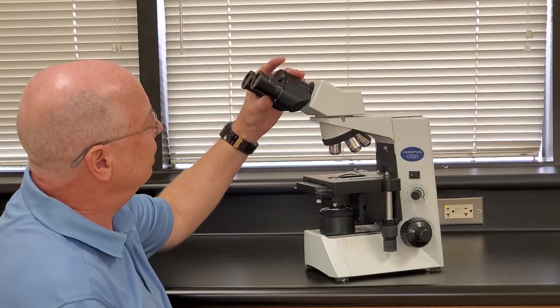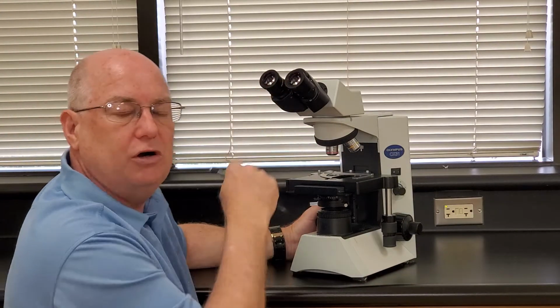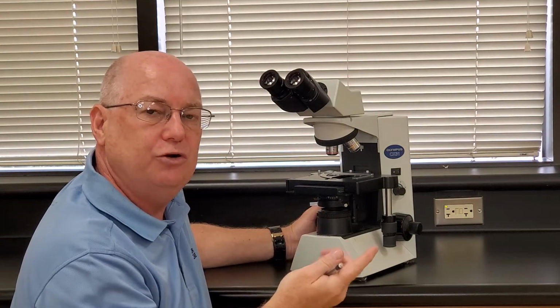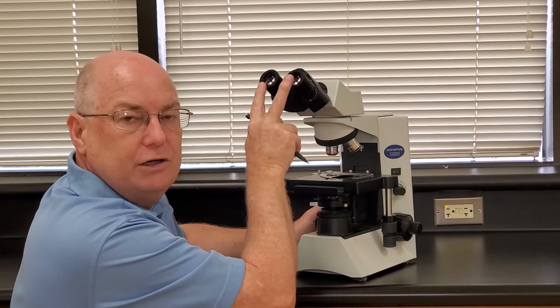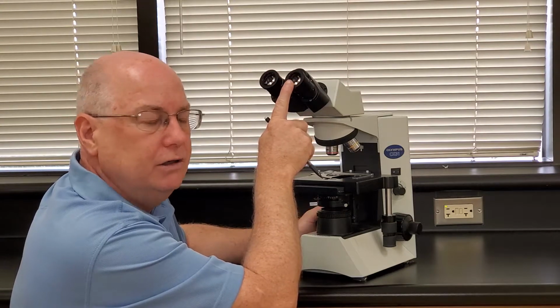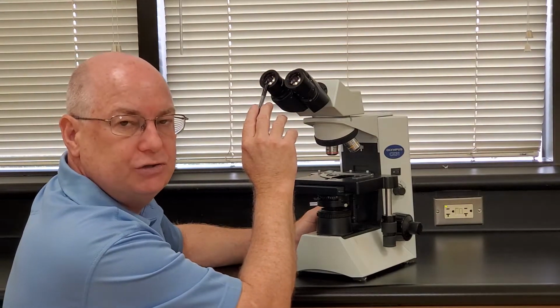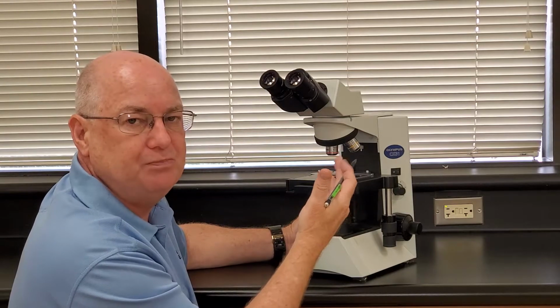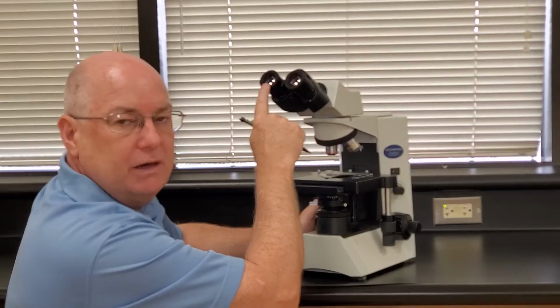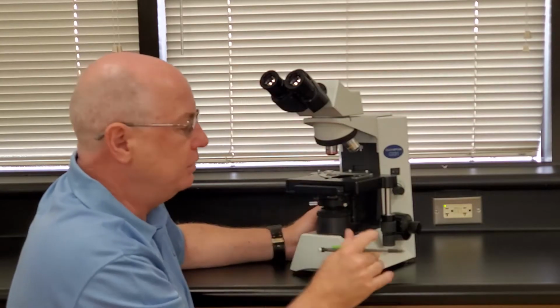These two structures right here, and I'm going to turn the scope in different directions for you, but there's two of these. Our scopes are called binocular scopes, because bi meaning two and ocular meaning eyes. You can look with both eyes. Some scopes only have a single ocular, and they're called monocular, and you have to close one eye to look through them. Now, these two structures are called oculars, or they're called an eyepiece. If we were to ask for this part on a lab test, you can say ocular or you could say eyepiece, and both would be correct.